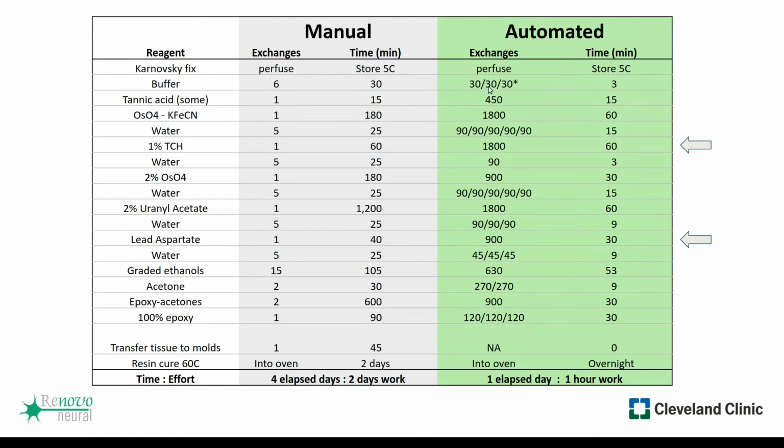So I have 3 rows of clean buffer, and when it goes to row 1, it sucks in and releases the clean buffer 30 times, and then moves to the next row that has clean buffer, because I'm trying to get it more and more clean with each exchange with new buffer, if that helps to explain it.